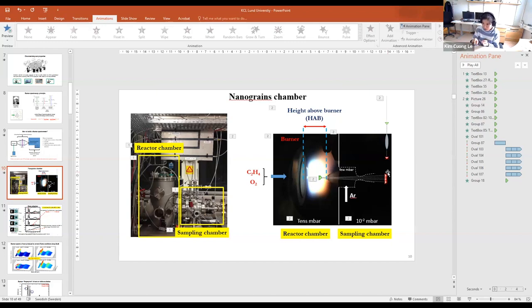Turn back to your question about putting the sample into the liquid and then onto the substrate. I would say that when you mix the sample into the liquid, actually you change the modification, the morphology of the sample. It looks like the soot generated into the atmosphere collides with the water vapor to form cloud. So it clearly changed the structure and the morphology of the sample. Yes, it is. Okay. Thank you.